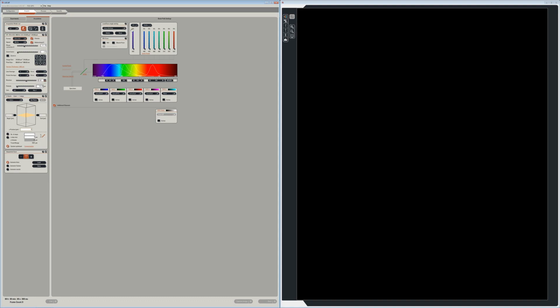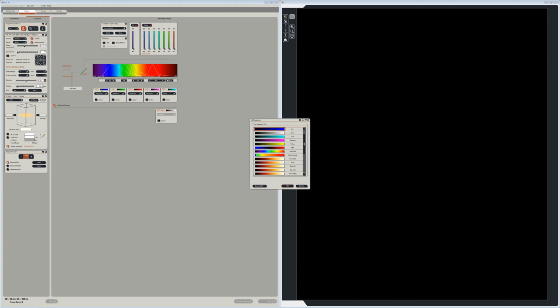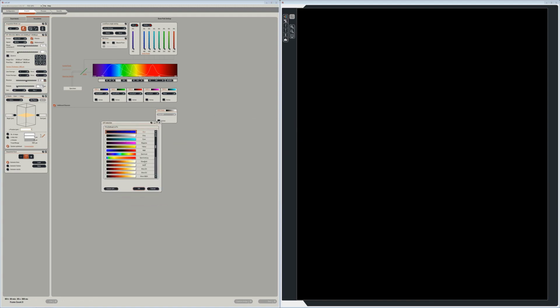So the first thing we're going to do is turn on UV and visible. And for most people, DAPI is always used, so it's already selected here. We're going to come to DAPI, and DAPI is blue. If you click up here next to where it says the PMT, you can see all the colors that you can choose for your different samples. In this case, I want blue for DAPI, so I'll leave it as is and just click OK.